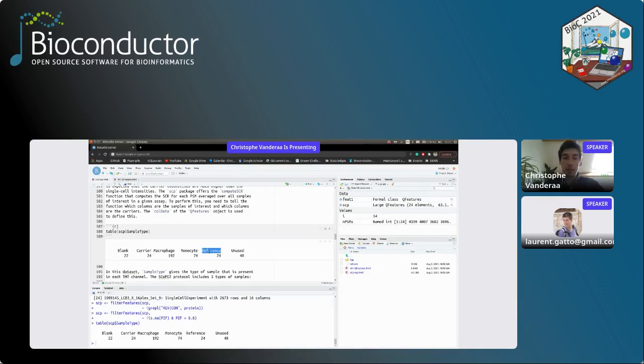So it contains a little bit more. It contains like five single cell. Well, it's not single cells. It contains 5 cells used for reference normalization. And then we have, and that's quite important, a sample called carrier. So in that sample, there are 200 cells, and this channel is used to boost the identification, because actually in one batch we then have much more material, and the more material you have, the easier it is to identify a spectrum.